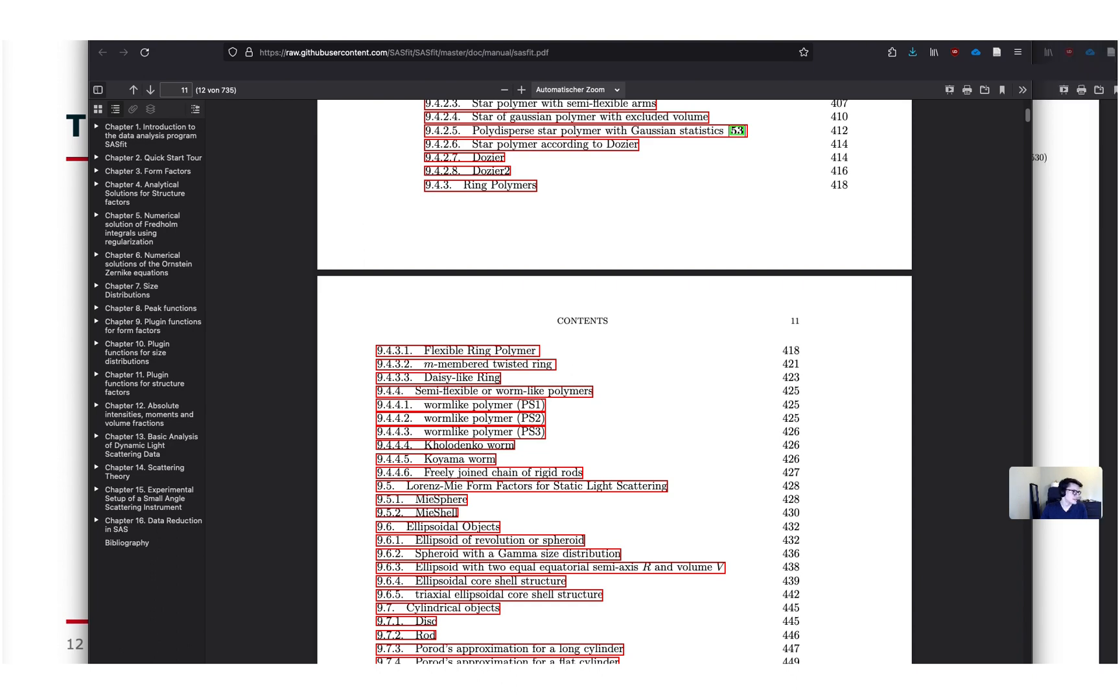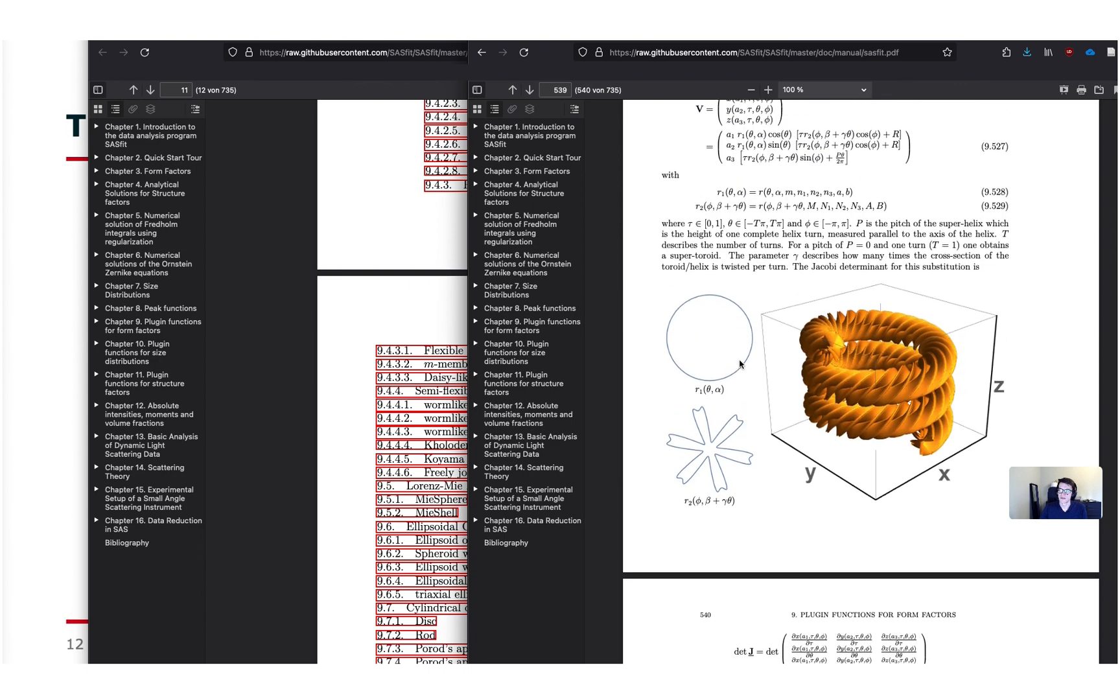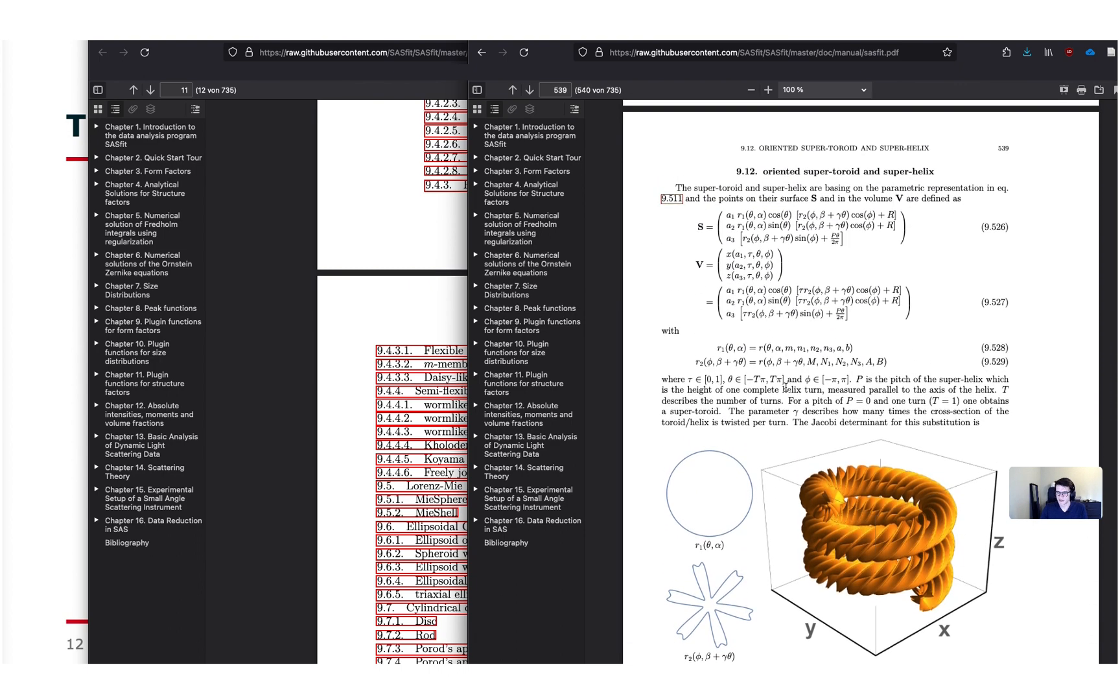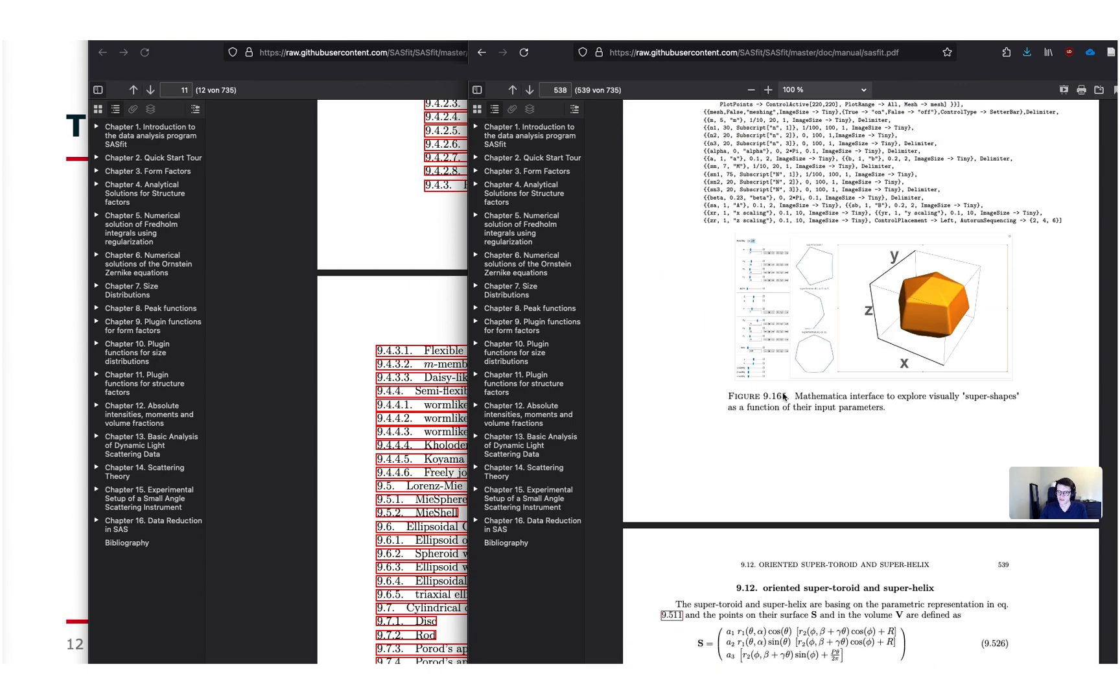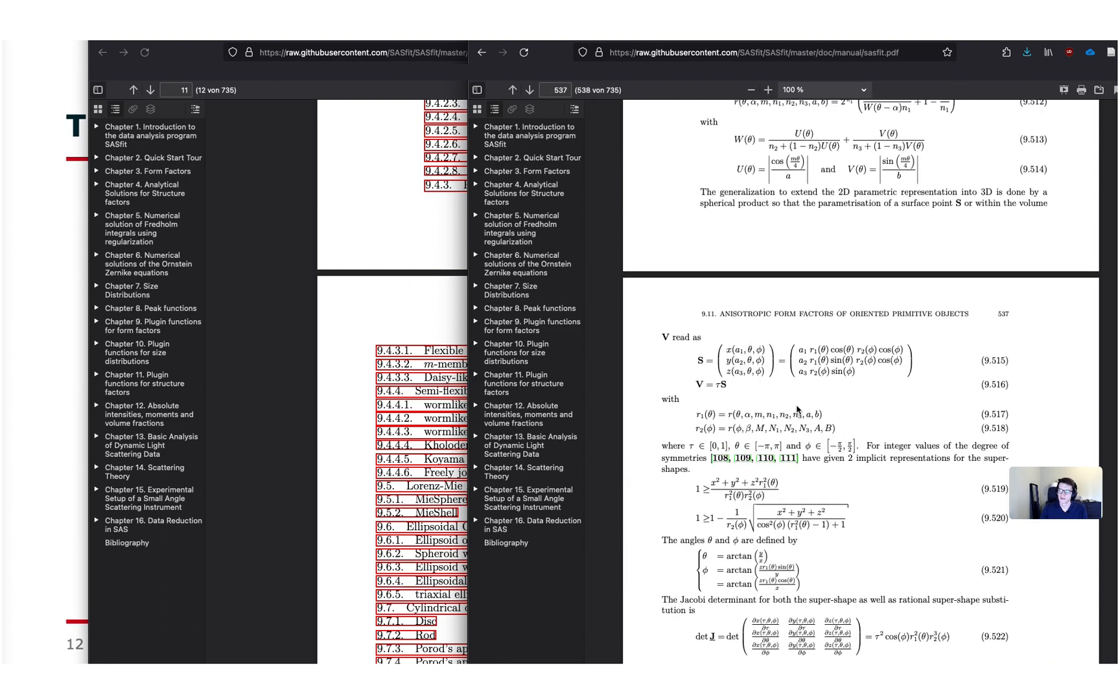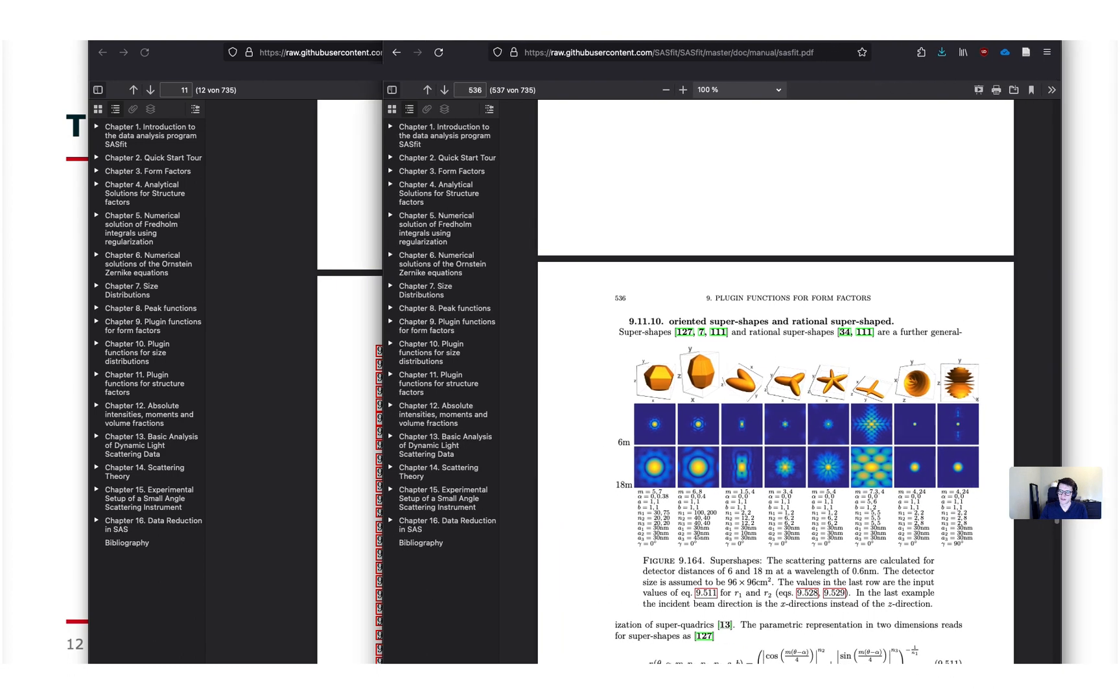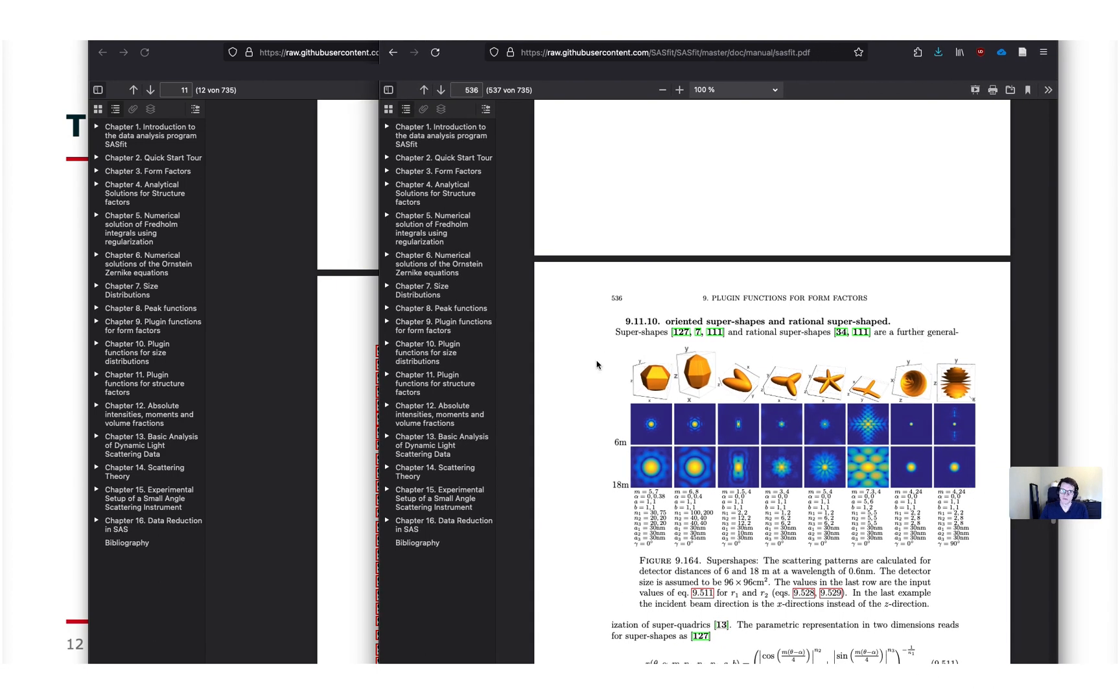Perhaps one second. I had this open already. Here it shows in the documentation of the model there are also some three-dimensional plots of the scatterers the models described. So it can be really complex shapes and types of some very specific form factors. I just wanted to mention this. This is some of the more recent implementations here.